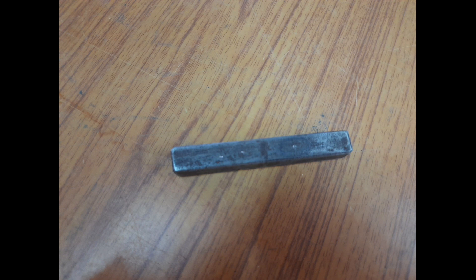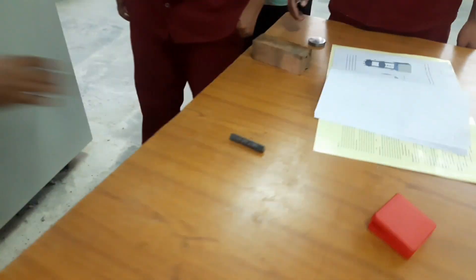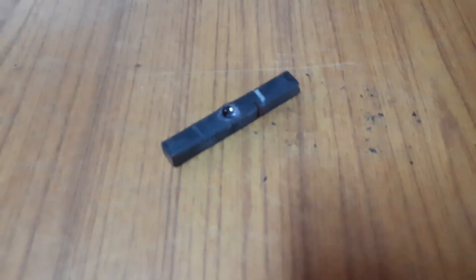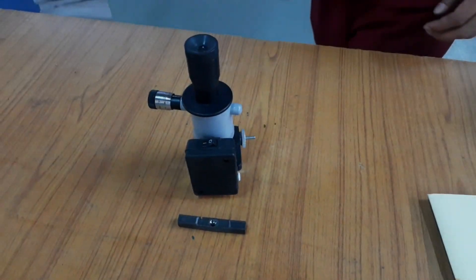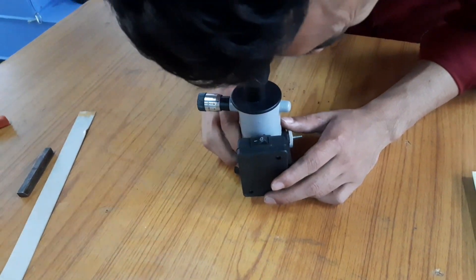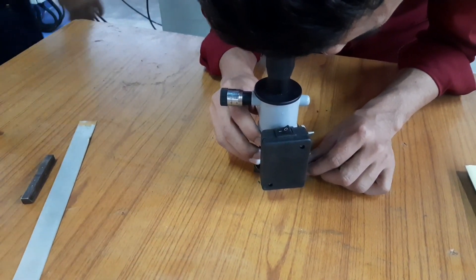This is the picture of the specimen before testing. In the end, we measure the diameter of the indentation by using a microscope. After finding the diameter of the indentation and the load applied to the specimen, the Brinell hardness number is determined.